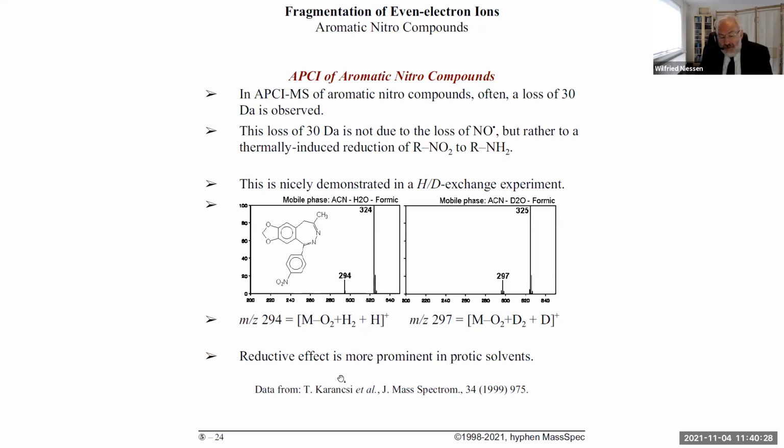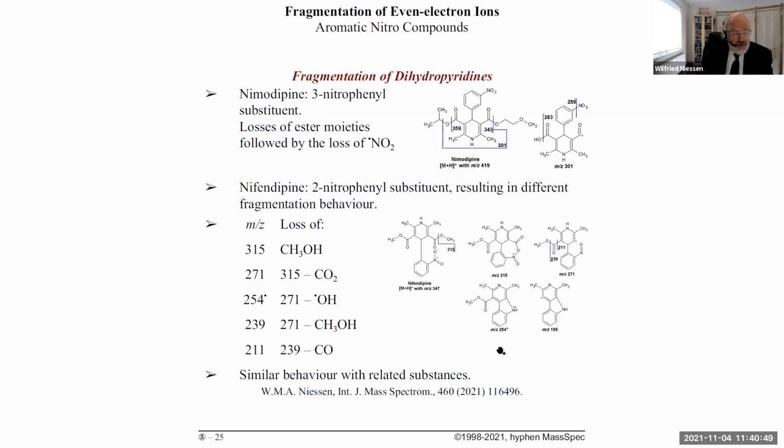And the reductive effect is more prominent if you have protic solvents. So it's more prominent in water-methanol than it is in acetonitrile. Yeah, so this is something which you have to be aware of if you look at these types of compounds.